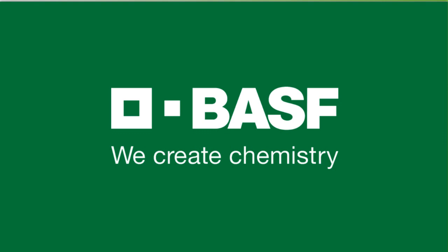Okay, we have another question. What could be the frequency of addition in the monoclonal antibody process, and what concentration should be added if stock is 10% solution? So that question varies. It is very dependent on two things. One is the cell type that you're using, and also the kind of process you're using. So for my customers that use fed batch, the concentration that seems to be the most used in those systems is between 1 to 2 grams per liter of poloxamer.